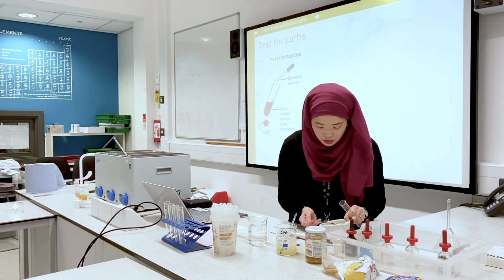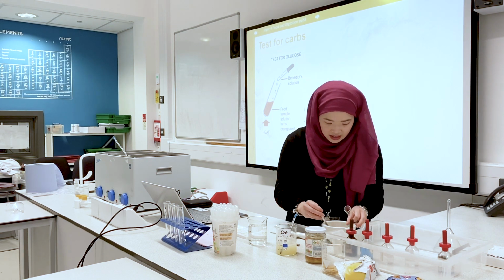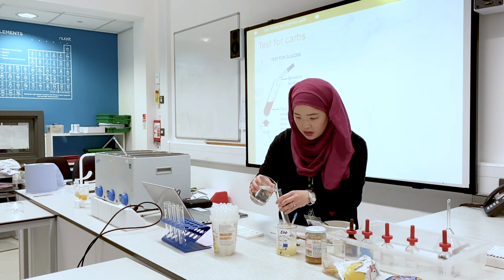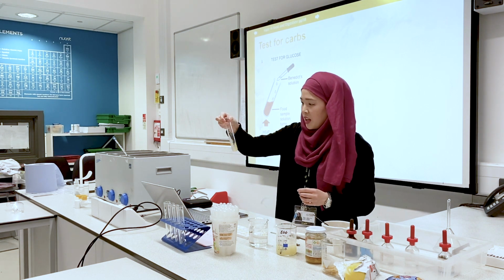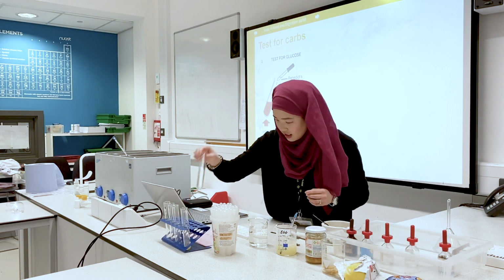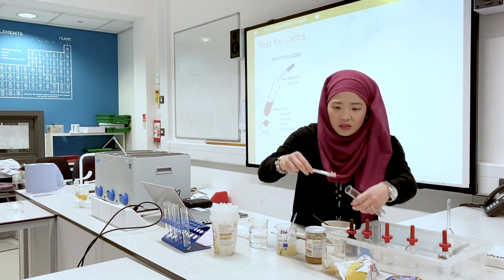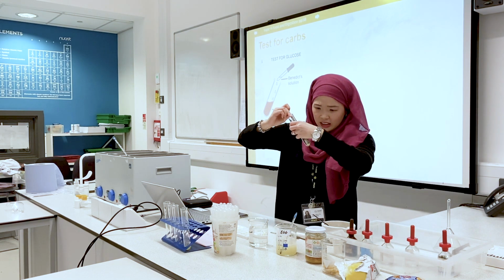I'm just going to scoop. I'm going to add a tiny bit of water to this as well, so it's as if it's been mushed up and saliva is added. Butter. I'm just going to try and add that in at the bottom.